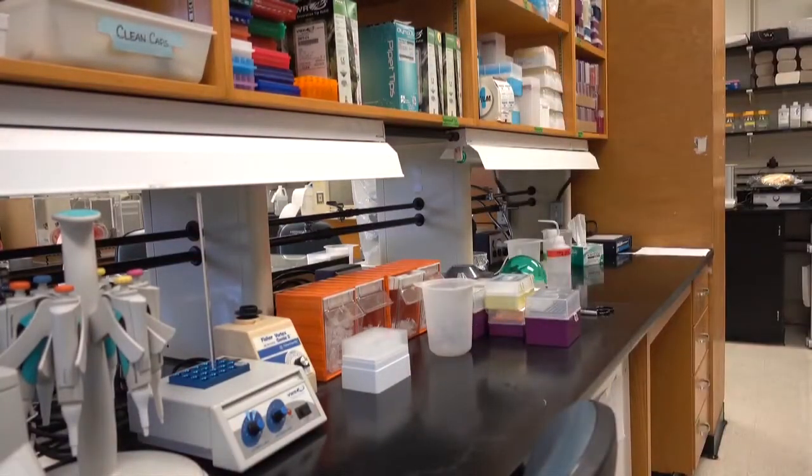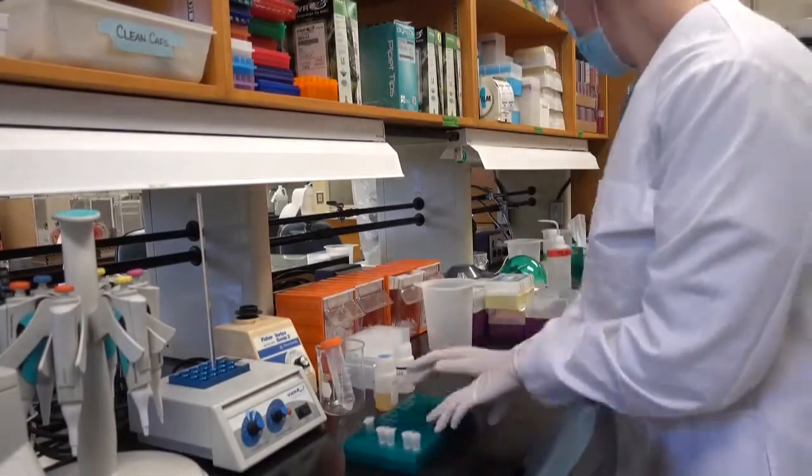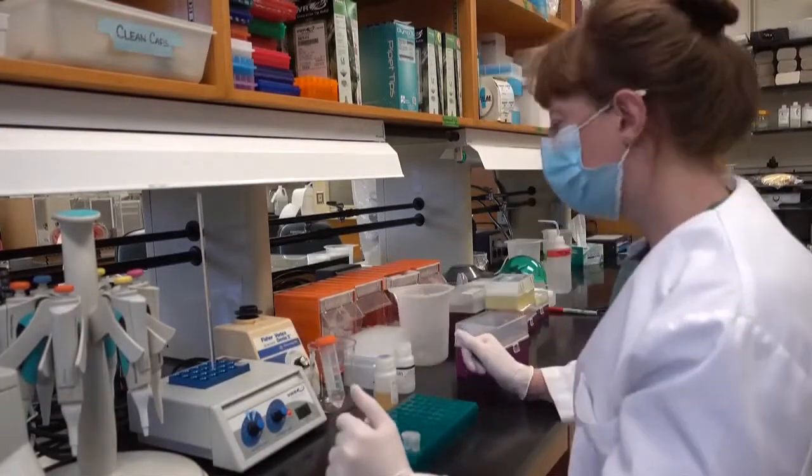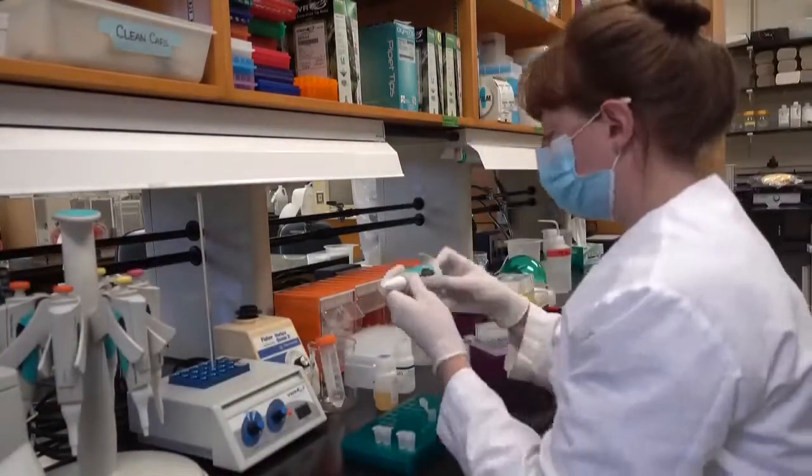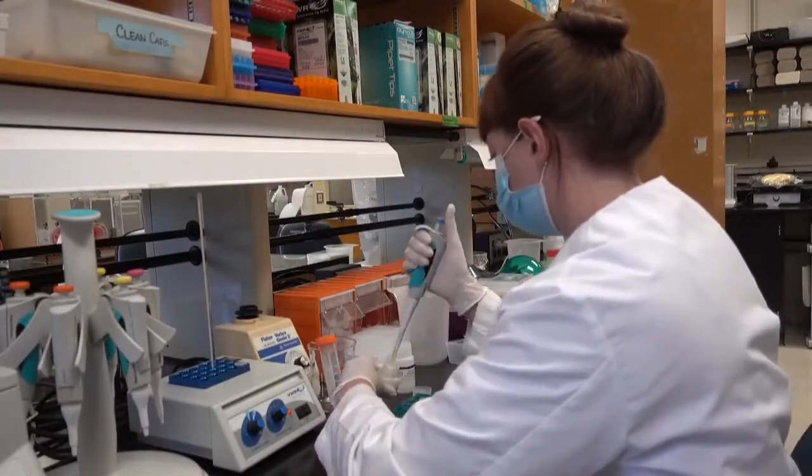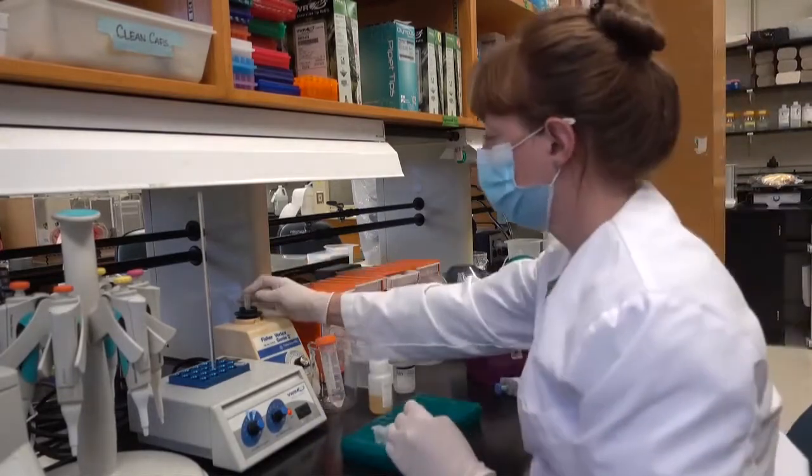Here you can see me getting set up and getting all the buffers and other supplies that I'm going to need for this process out and ready to go. And all of these buffers need to be added to my sample in very specific amounts. So to do this, I use a pipette, which allows me to measure these amounts of liquid accurately.